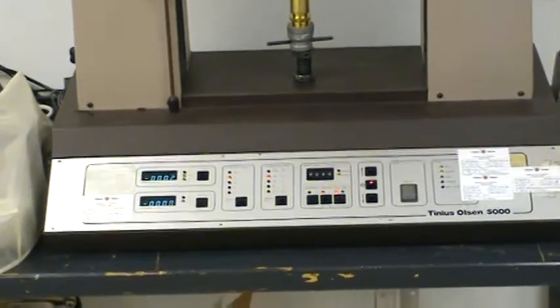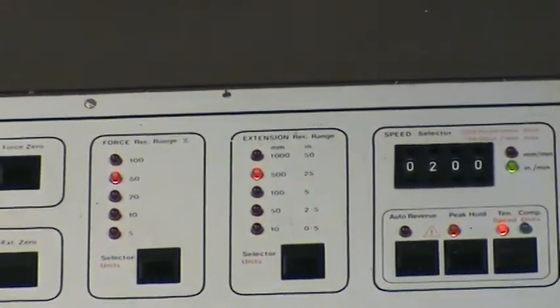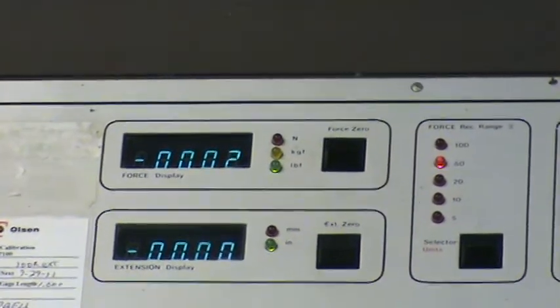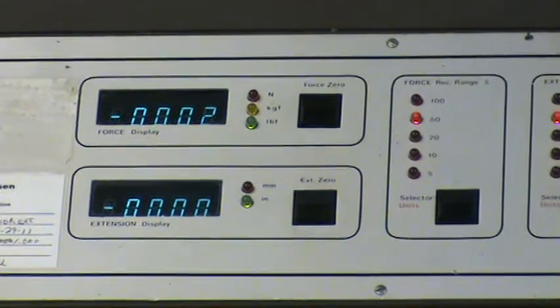What this machine is going to do is stretch the pipe at a fixed elongation rate of 2 inches per minute, as you can see in the upper right. The machine is also going to record how many pounds of force it takes to stretch the pipe at that rate.